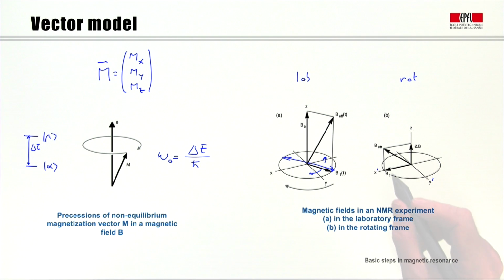Well, the frame is defined in such a way that the B1 component, which was moving before, now appears stationary. That simply means that we move with the vector. It's just as if we step on a carousel, we move with the wooden horses so that they appear stationary, whereas if we are not on the carousel, we see the horses as moving around.